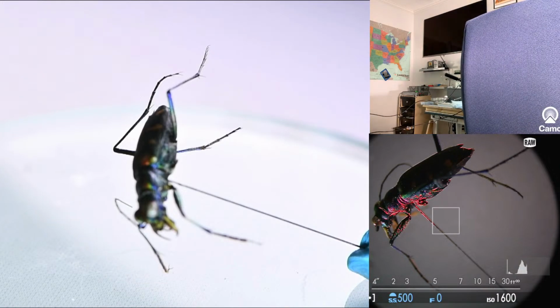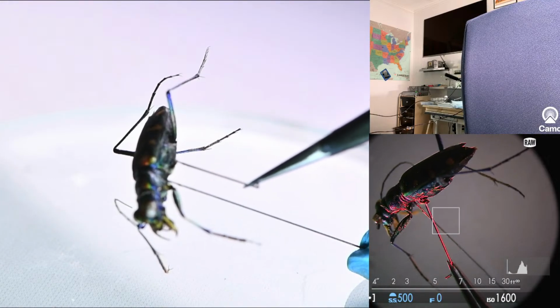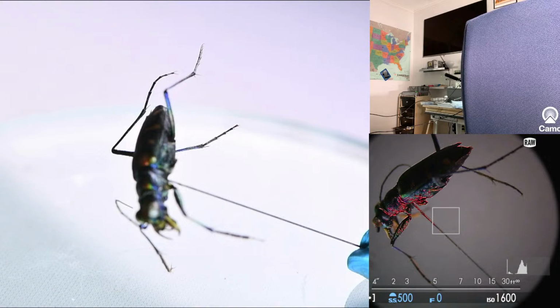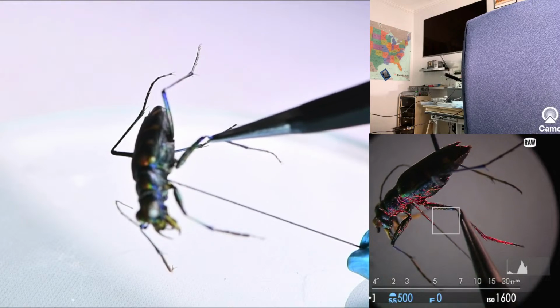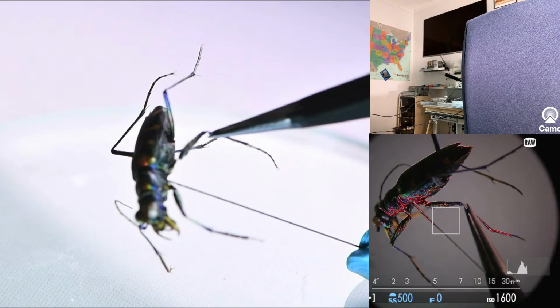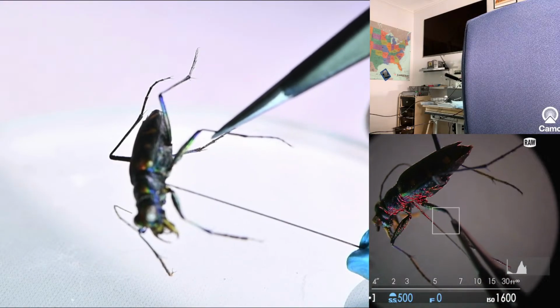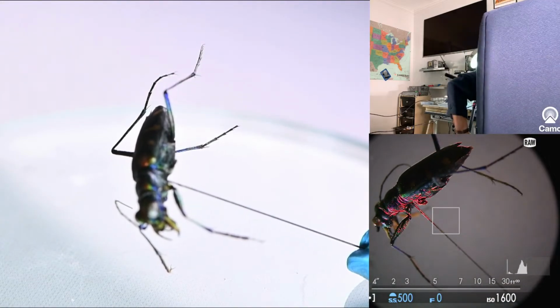Alright, so I'm going to pick up the drop of glue straight up to the stump of the appendage. Don't hold it on too long. If you hold it on too long, the pin will stick. Got about 2 more seconds. Unfortunately, I'm not looking through the microscope and I can't see. The end of this leg has a hollow in it that I am putting onto the point that has the glue on it. No, I am going to have to look through the microscope to do this, guys.